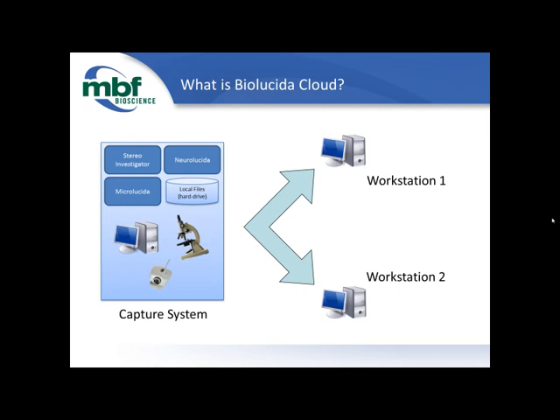Okay. The lab that you're working in actually has multiple workstations. You have the original system that you actually captured the image on, and you have one or more other workstations where you guys do analyses like cell tracing, cell counting, or stereology probes. And that's a pretty typical situation. Now, let's say that you need to open up the image that you just captured on the capture system on one of the other workstations because you need to free it up so someone else could use it.